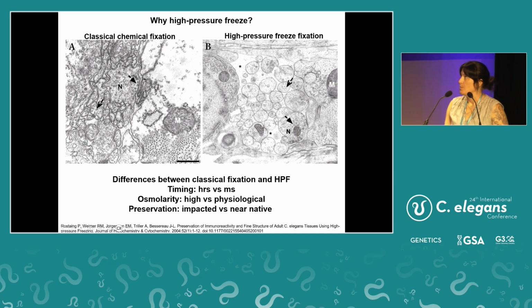So you might end up with an impacted ultrastructure preservation versus what we think is a more near native physiological state using high pressure freeze. That's not to say that the classical chemical fixation method isn't useful. It very much is. This just depends on the question you're asking and your area of interest.